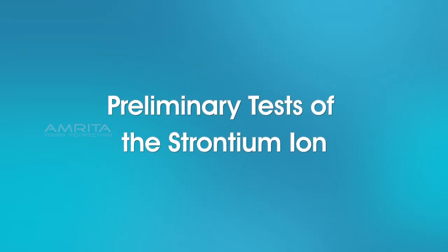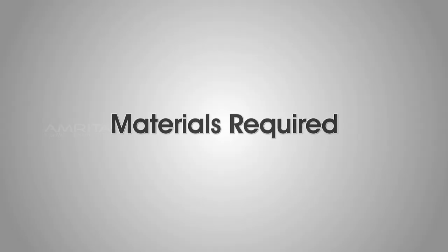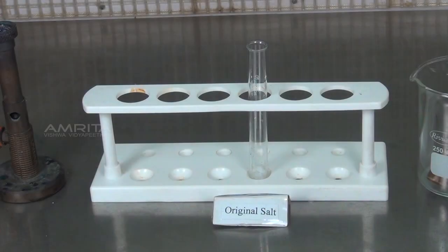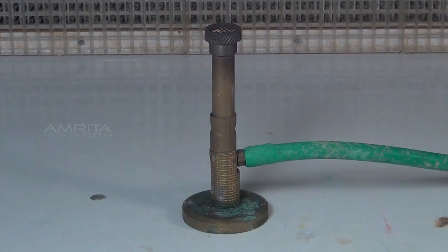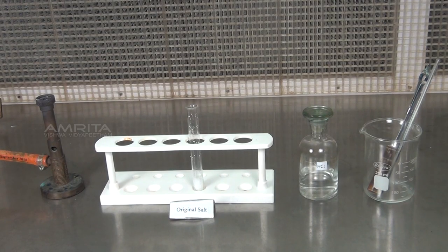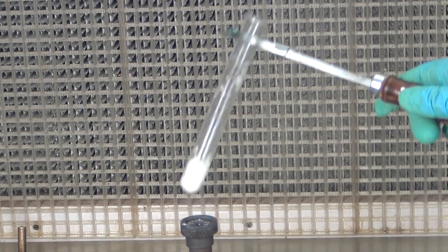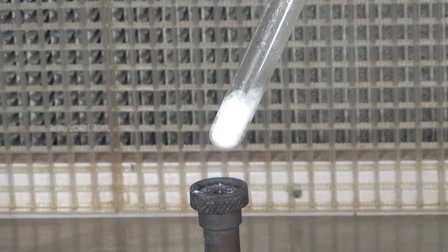We look at the preliminary tests of the strontium ion. Dry Heating Test. Materials required: original salt in a test tube, test tube holder and Bunsen burner. Procedure: take a small quantity of salt in a test tube and heat it over the Bunsen burner. A white residue glows on heating, indicating the presence of strontium ions.